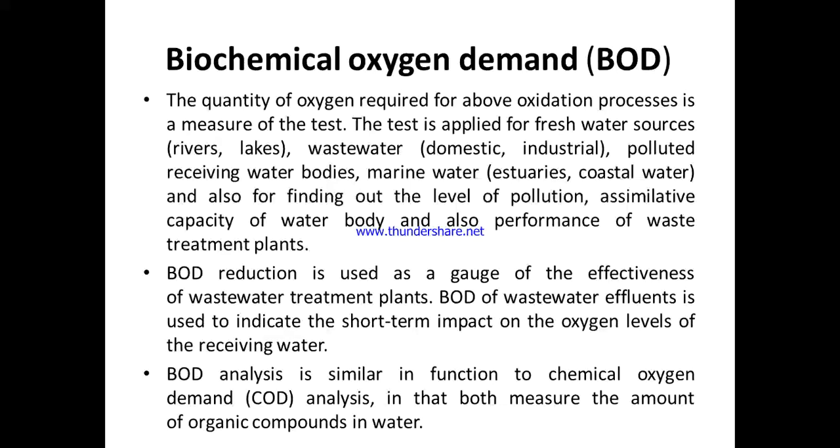तो हमने क्या किया? 10 मिलीलीटर वाटर सैंपल लिया. अनडाइल्यूटेड कितना है? 10 मिलीलीटर. उसके बाद हम क्या करते हैं स्टूडेंट्स? We do a volume makeup by adding distilled water and we prepare 100 मिलीलीटर diluted water sample. हमने क्या किया? 100 मिलीलीटर जो है उसका वॉल्यूम बढ़ा दिया डिस्टिल्ड वाटर ऐड करके.